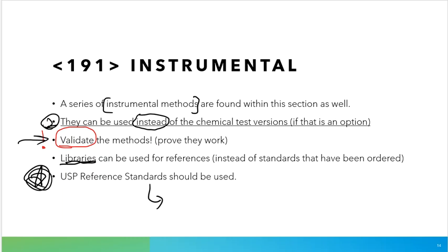All right, so USP standards, though, I want you to kind of think about these USP standards, what does the USP stand for? Ka-ching, ka-ching, ka-ching. That's what they stand for. So these are sometimes very expensive standards for just a very, very tiny amount of material.